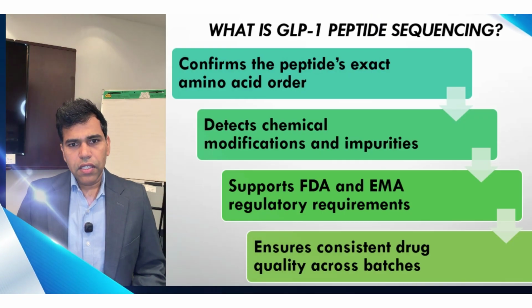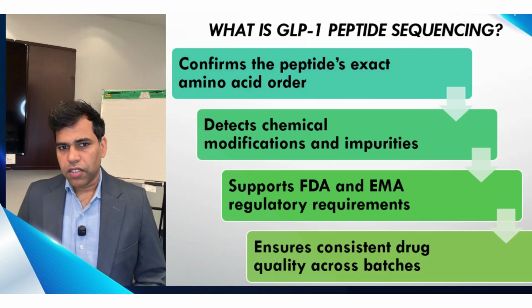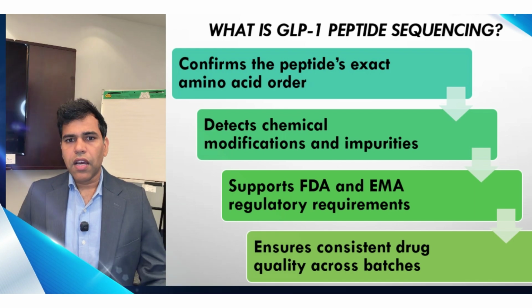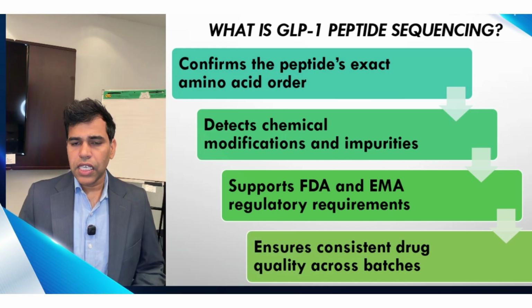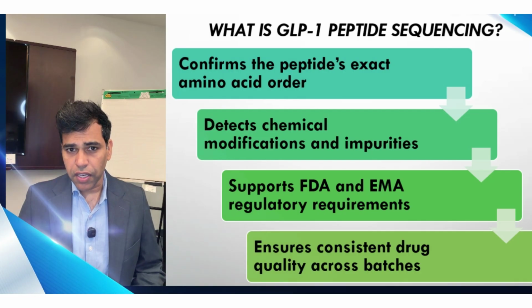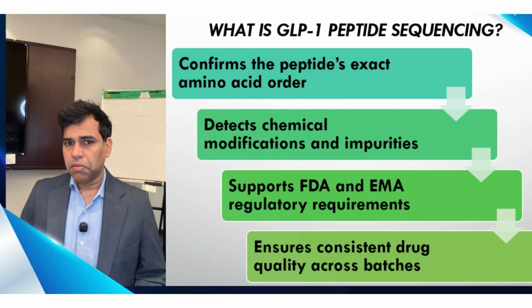What is GLP-1 peptide sequencing? Let's start with what we are actually doing when we sequence a GLP-1 peptide like semaglutide.